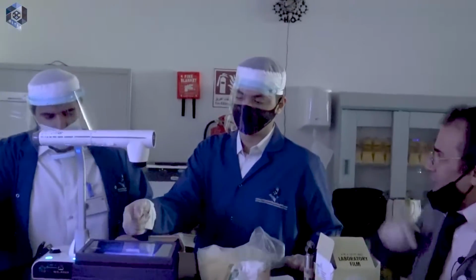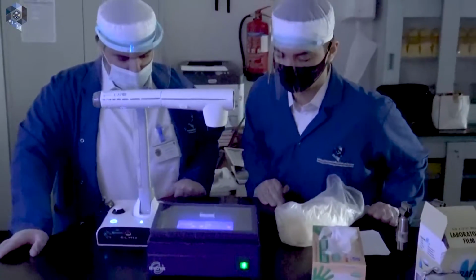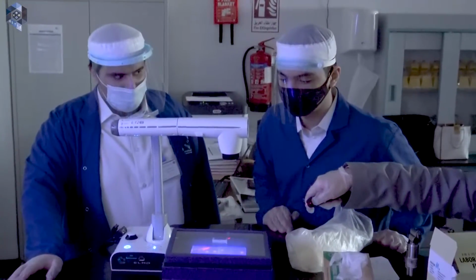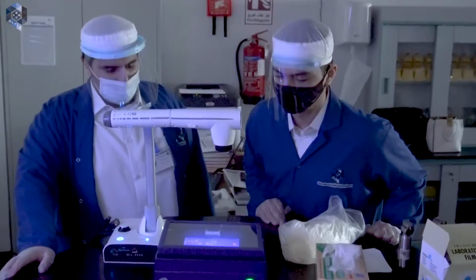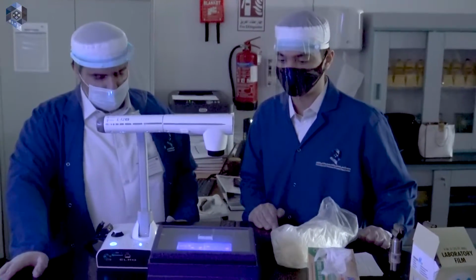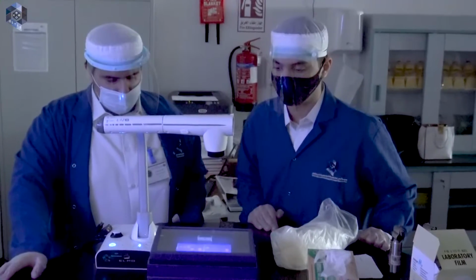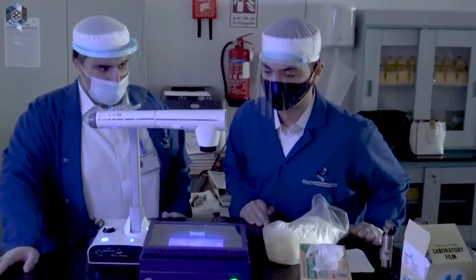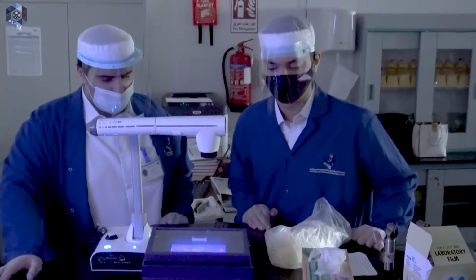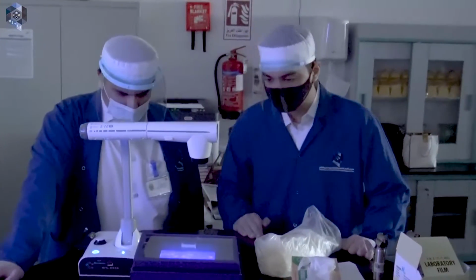Here you have the recombinant. That's absolutely true. Now, these are the wells. So, the recombinant one migrated or moved less distance. Why is that? Because their size is more. When they are joined together, they are bigger, so they move less.